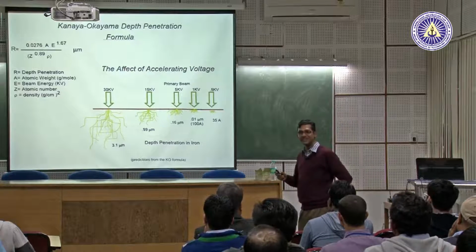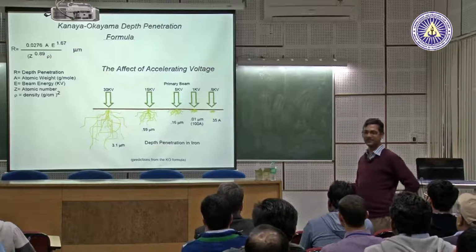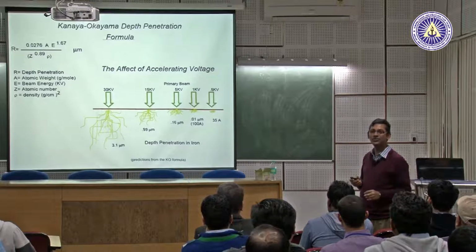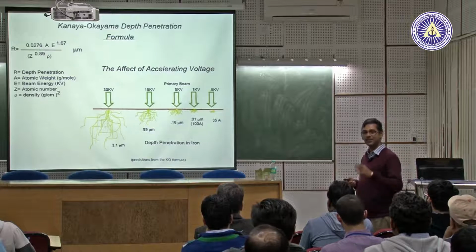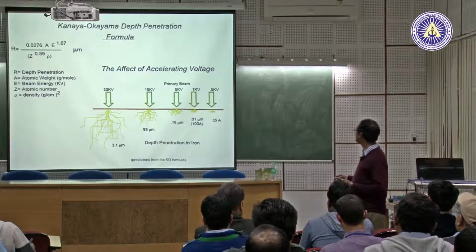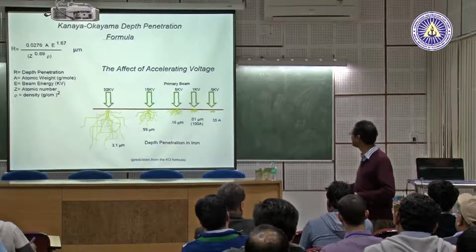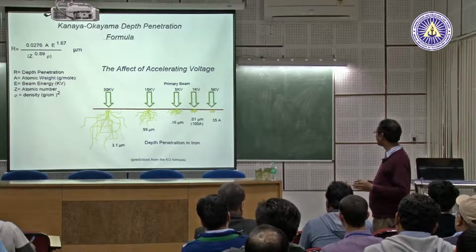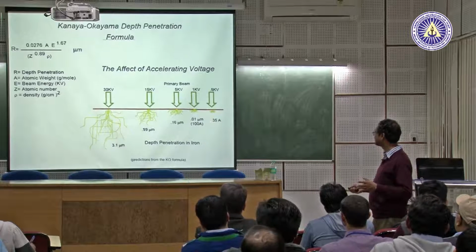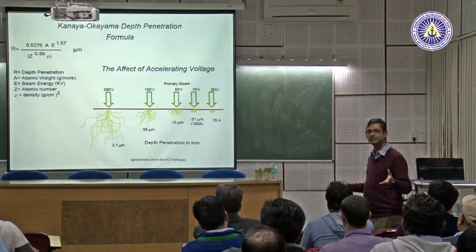Nowadays you can do imaging using cold field emission guns at a voltage of 0.1 kV. How many of you have tried? 0.1 kV, 100 volts. You can start with imaging. We have lenses inside this column with which you can do that. It's called through-lens imaging. So from 0.5 kV to 30 kV, 40 kV is the range of voltage people use. Remember one point. Here the interaction volume is very small, 35 angstrom depth, and here it is 3.1 microns. Almost how many times can you calculate? Anyone in the class?